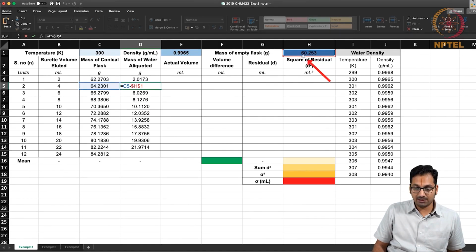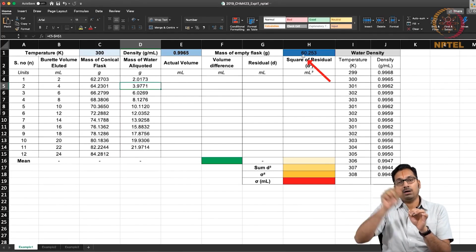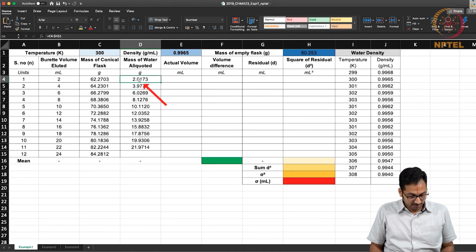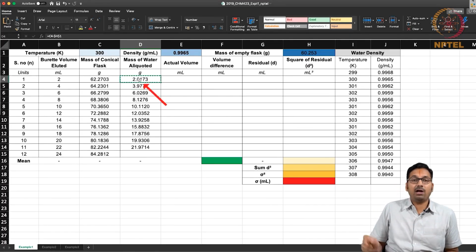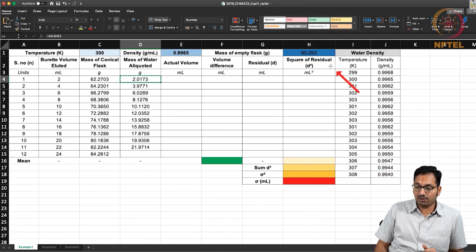So this helps you, because if you have many different values, it takes a lot of time to take the difference carefully. Otherwise, if you copy paste this formula, it will be erroneous without the dollar, because it will end up taking differences not from this but also from the other cells that go here.